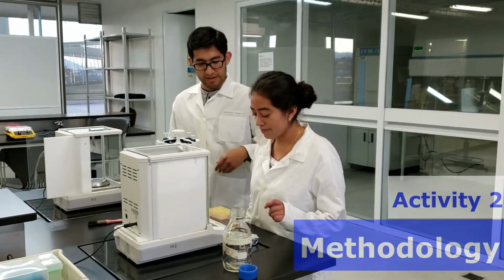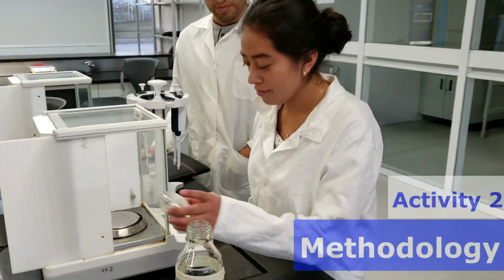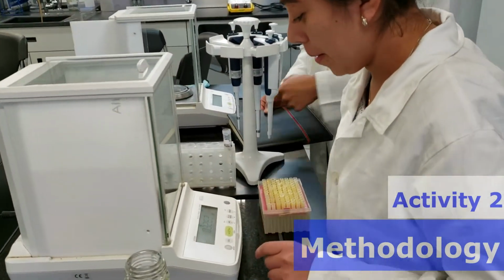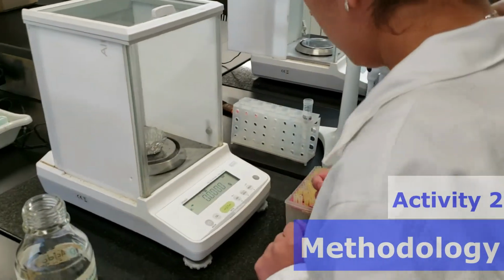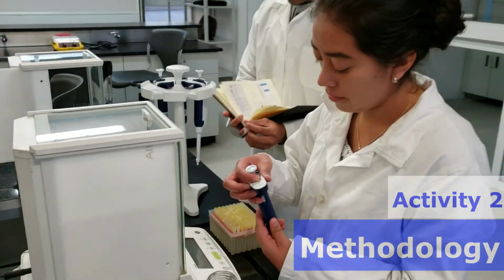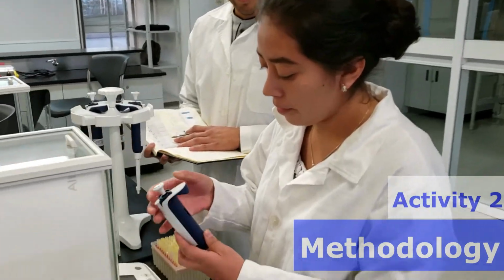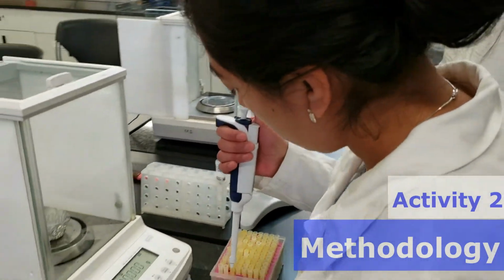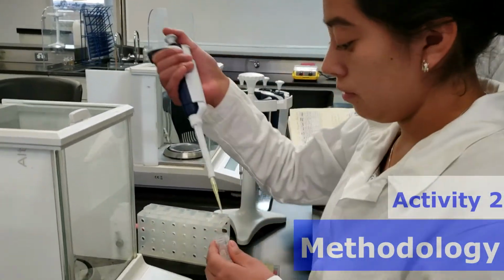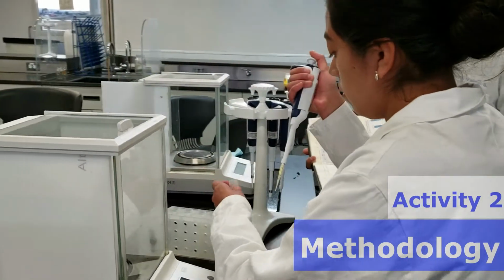Activity 2. Transfer the following amounts of water, low, intermediate, and high volumes, with micropipettes of 20, 200, and 1000 respectively, from 2 to 1000 microliters. For each sample, the volume deposited on the aluminum paper on the previously tared scale was reported. The high volume relationship was made with the water density, 1 gram per milliliter.